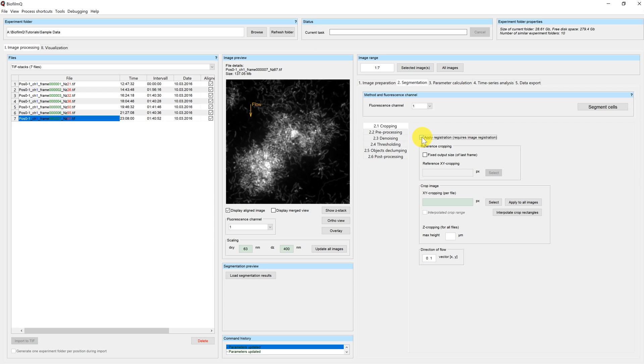If you want to do cell tracking or create video files in the end, you have to apply a reference cropping now. The reference cropping will put all the cubes into the same coordinate system, so that you can later on track your cells.